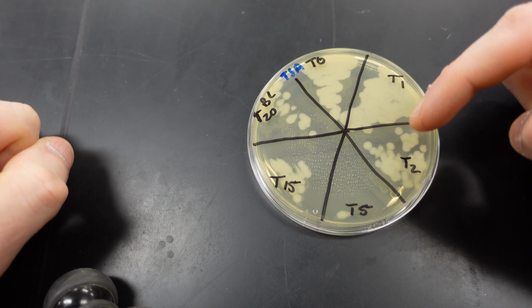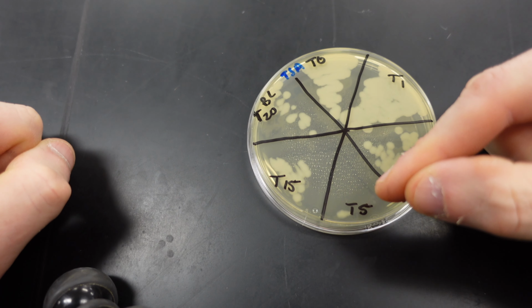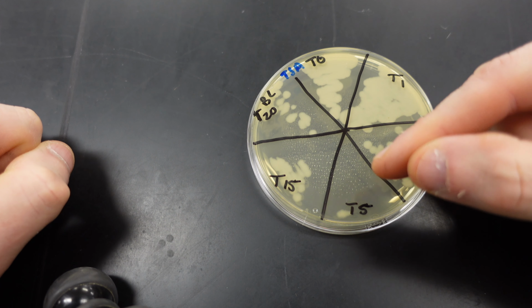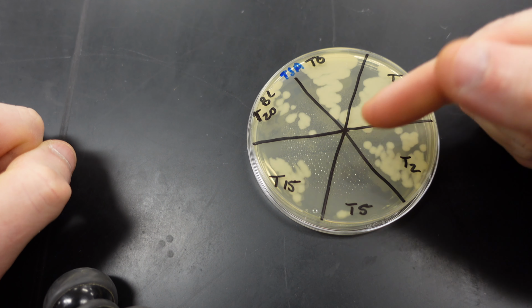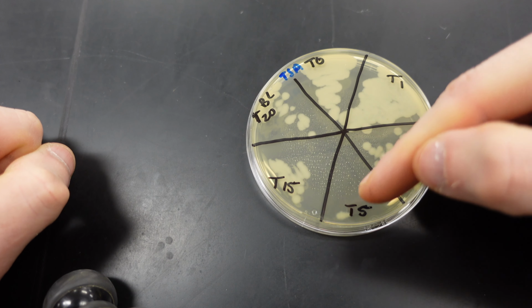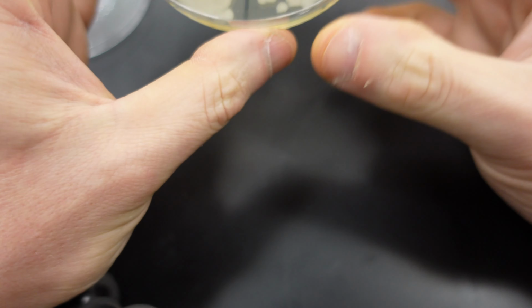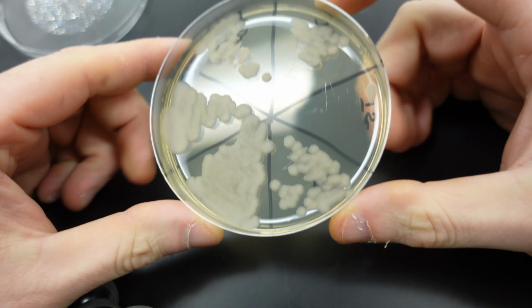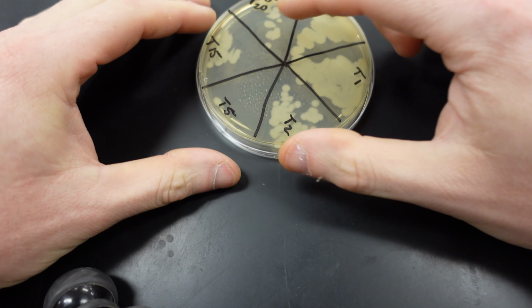So you can see that there's growth for each one. Time 5 doesn't have as much growth, but that's basically due to when you put the loop in, how many of those endospores you're actually grabbing. So here I didn't really get much, but you can see that Bacillus cereus has a really resistant endospore that it forms. So even after 20 minutes in the boiling water, we have growth.